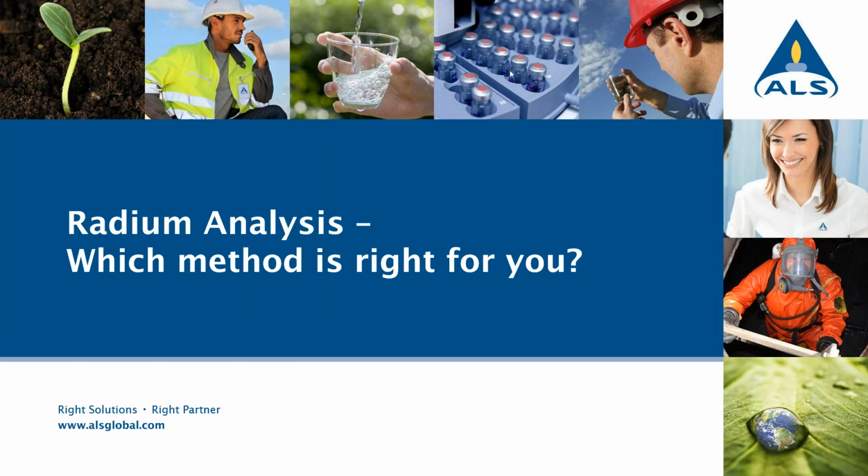For ALS, we are the RAD Lab, and I'm going to talk to you today about radium analysis and which method you might want to choose. So just to give a quick start.